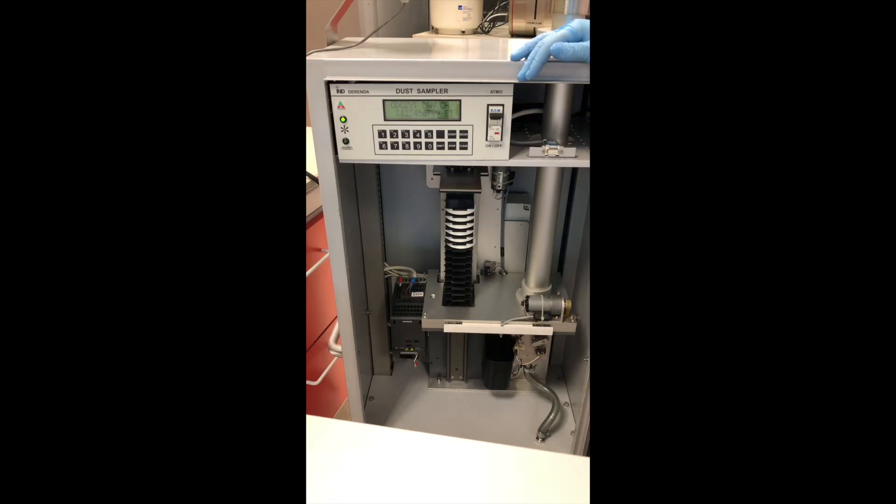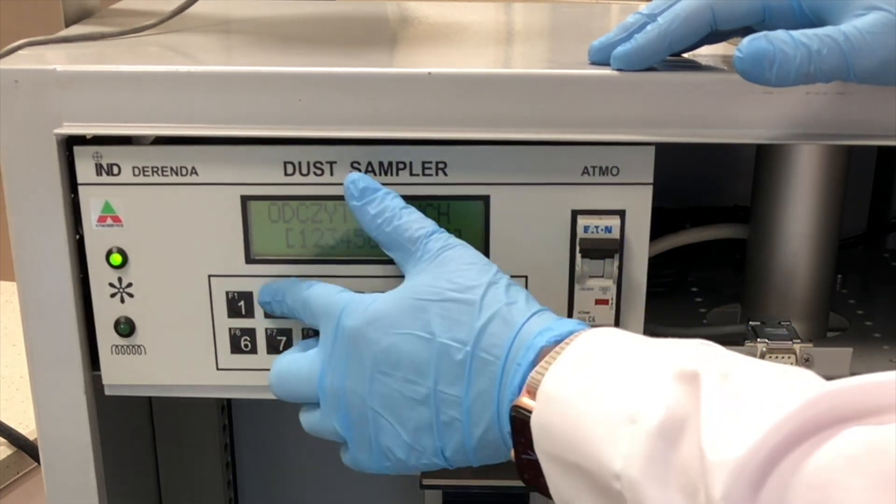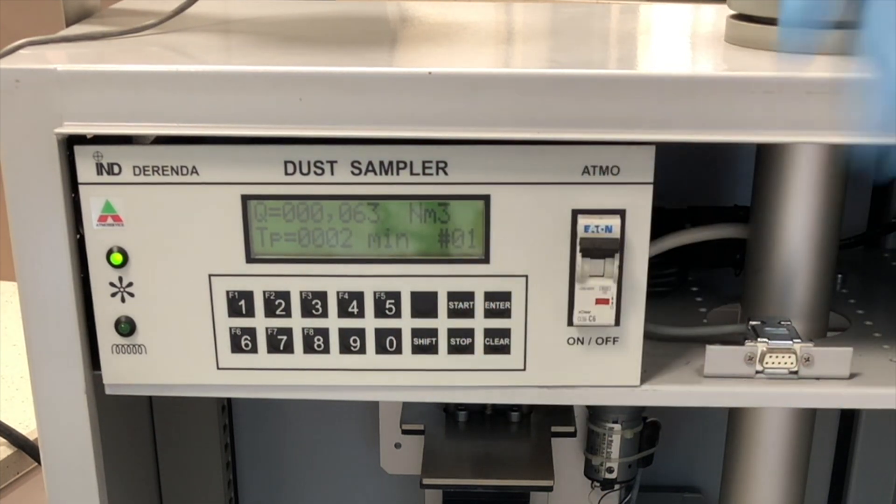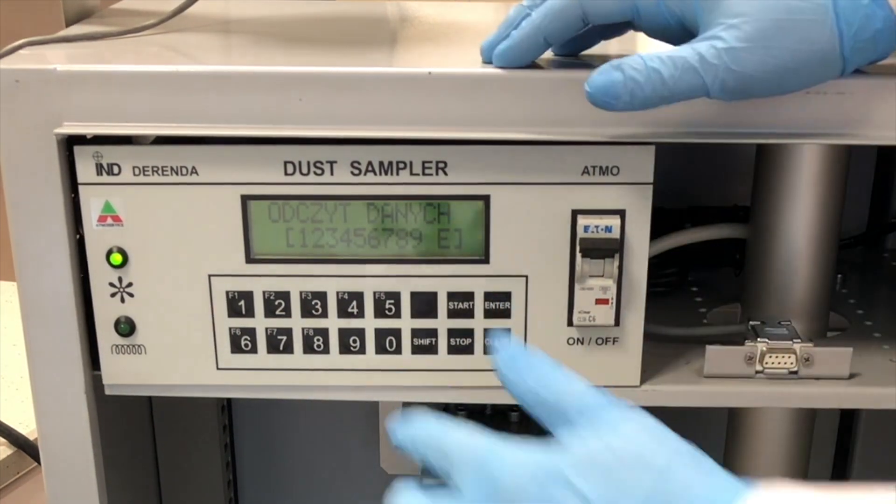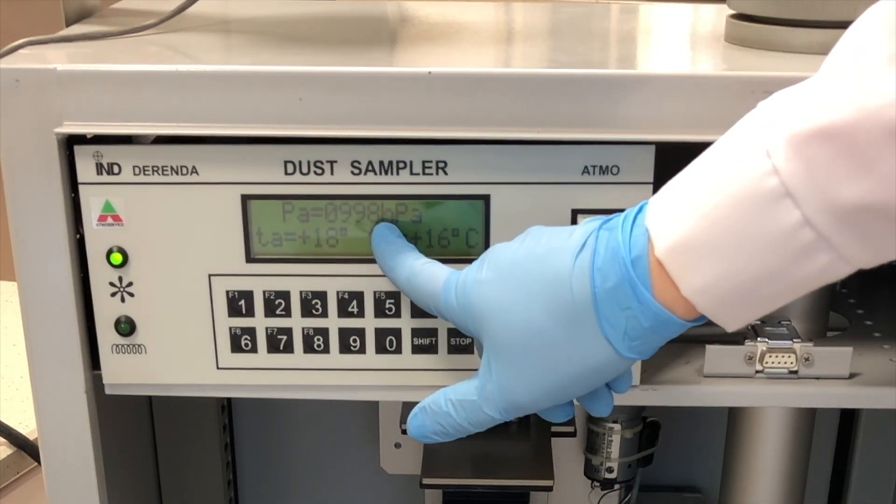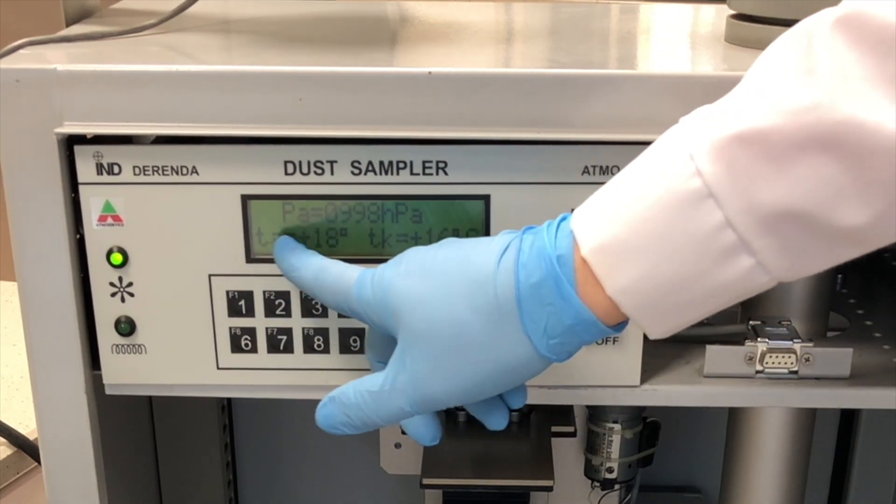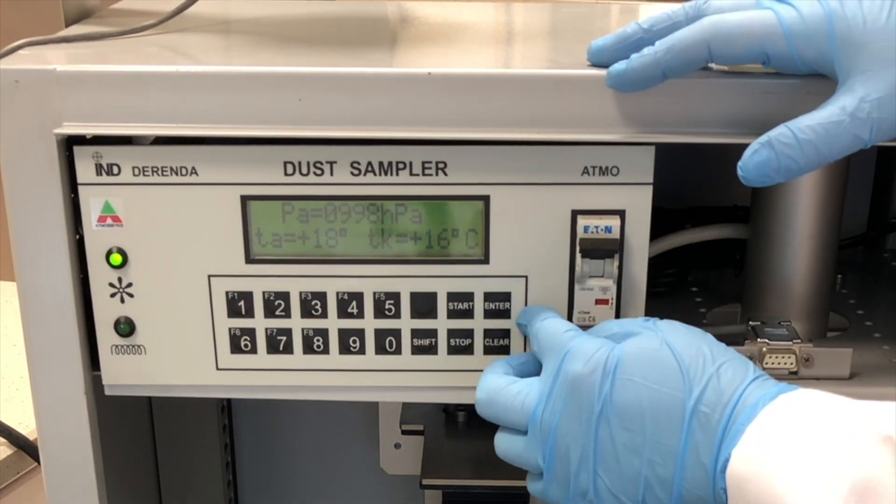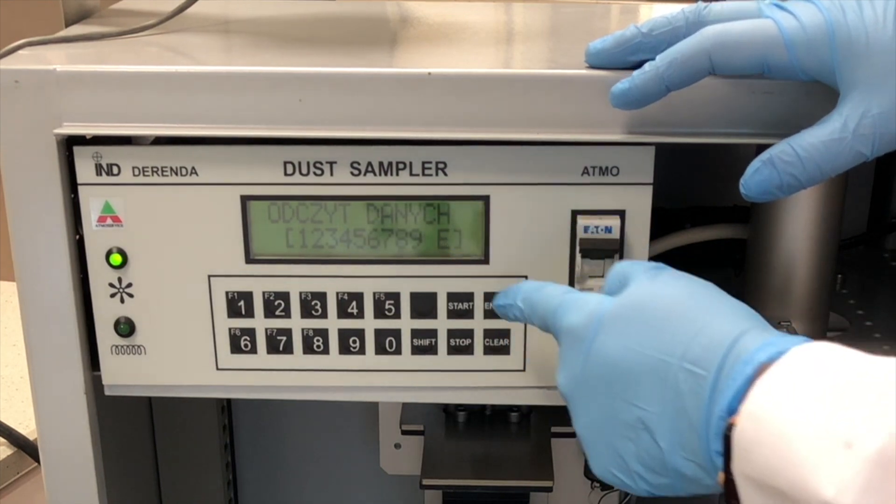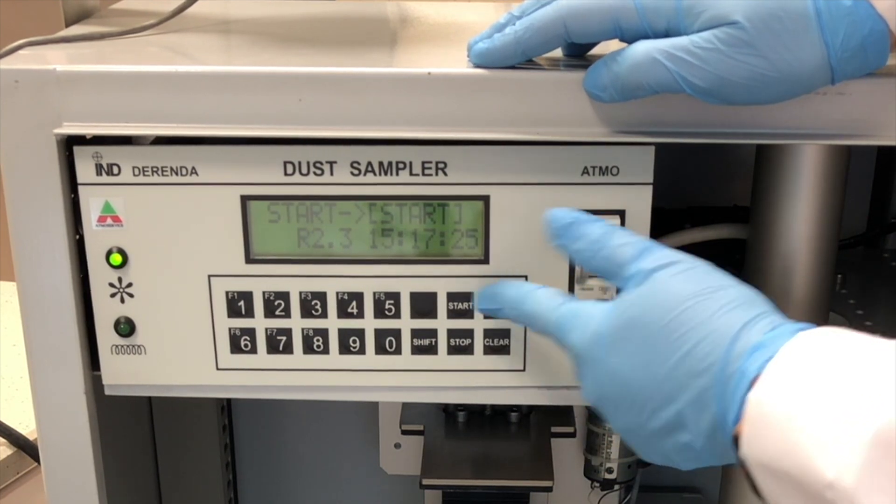You can check what are the data. When you press 1 you've got the volume of air in cubic meter and the time. When you press 2 you've got the volume of air which went through the filter but in the standard conditions. When you enter 3 you've got the atmospheric pressure in hectopascals and you've got the A, it means the ambient temperature of air and this is the temperature of the equipment. The other numbers are connected with the parameters of the sampler.